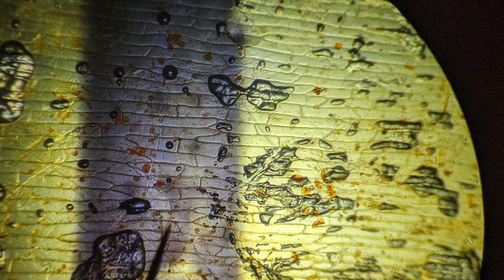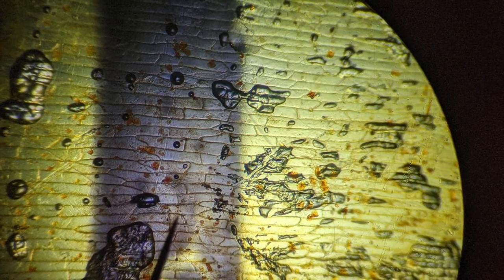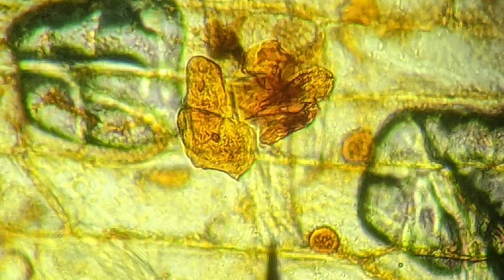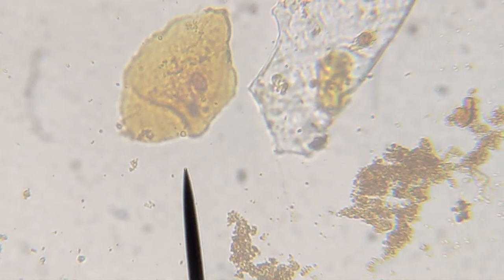You're going to end up with a few measurements: the length and width of an onion cell per millimeter, the average width of an animal cheek cell, the size of an onion nucleus, and either measured or derived, the size of a cheek cell nucleus. From there you can start to derive, based on estimation, the cheek cell nucleus to prokaryotic cell size ratio.